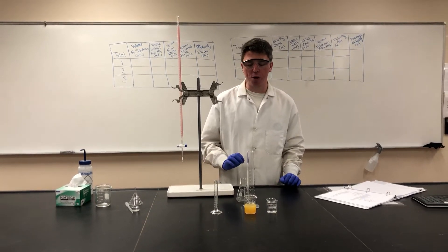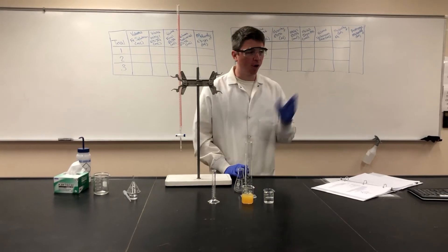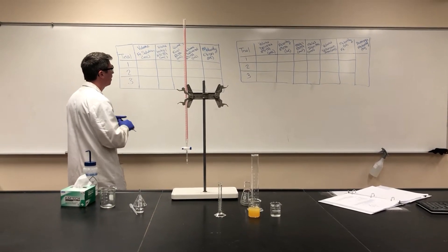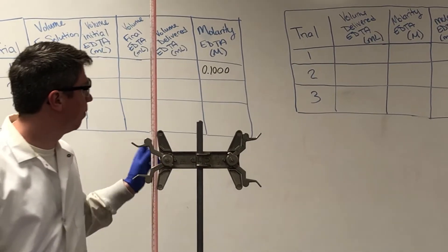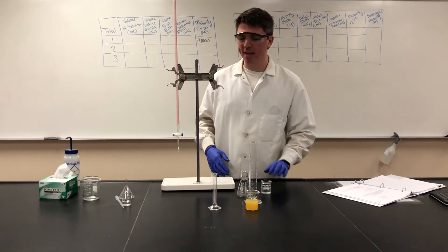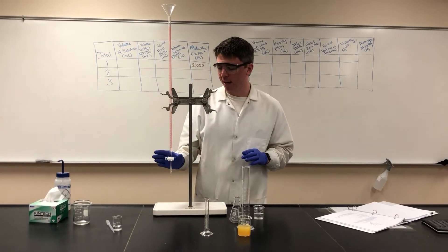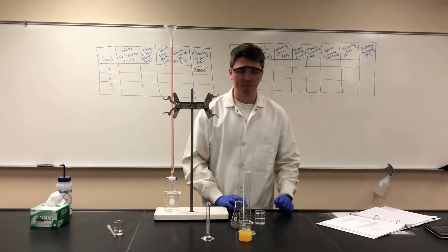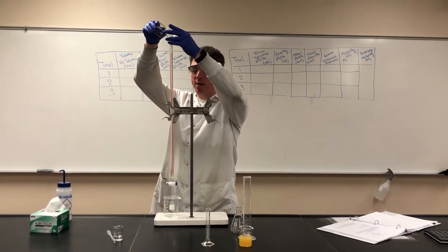Because we're doing a titration, we need to know the volume of our unknown and the volume and molarity of our known. Looking at our reagents, we find that the molarity of our EDTA is 0.100 molar. Because we know the concentration of this, we will add this as our titrant to our burette. The easiest way to add things to a burette is to put a funnel on top of it. Make sure the stopcock is closed and have a waste beaker under your burette just in case anything spills. We'll add our EDTA to our burette until it is full.